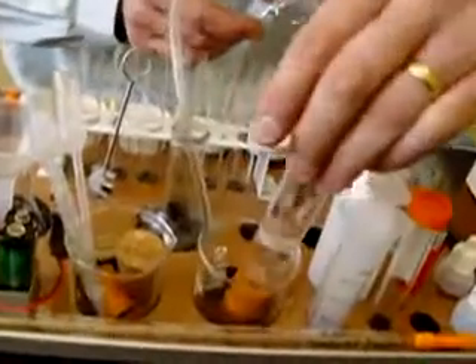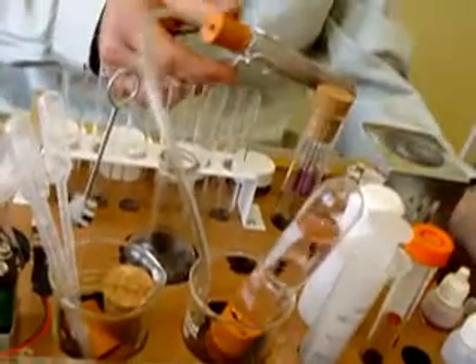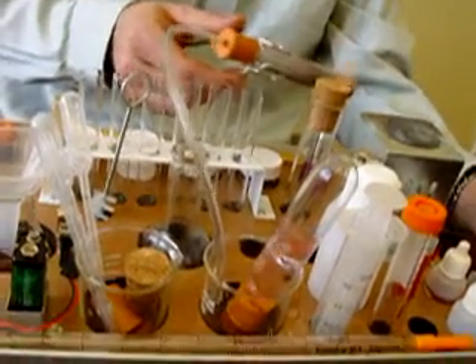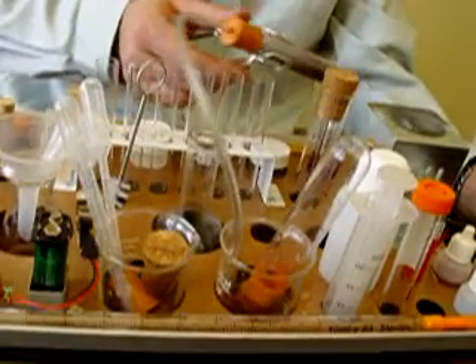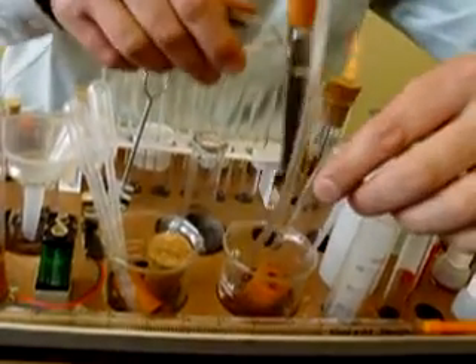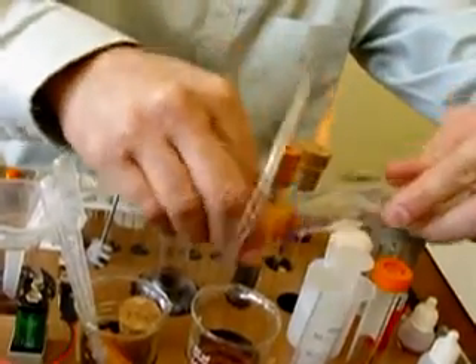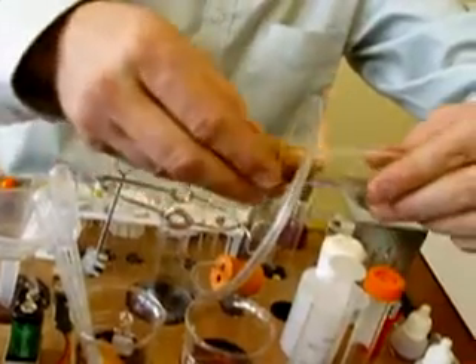I'll now invert that test tube into the beaker to collect the oxygen. Now that it's collected oxygen, I'm going to remove that bigger test tube from the end and stopper it so that we can trap all the oxygen that's in that larger test tube, which acts as the gas jar.